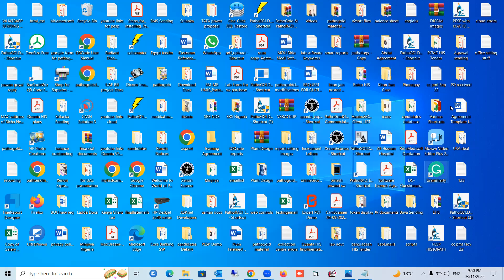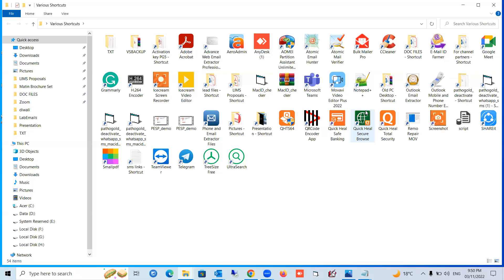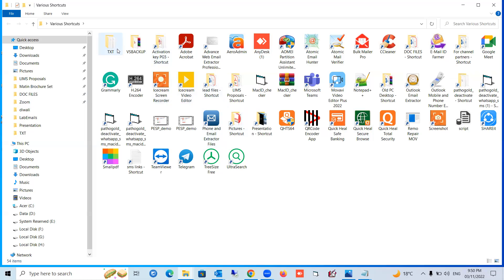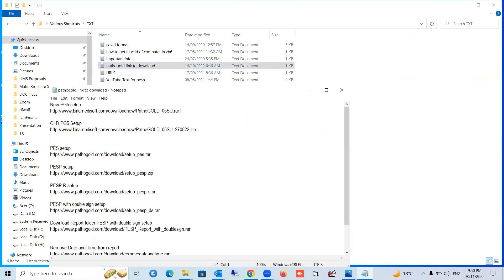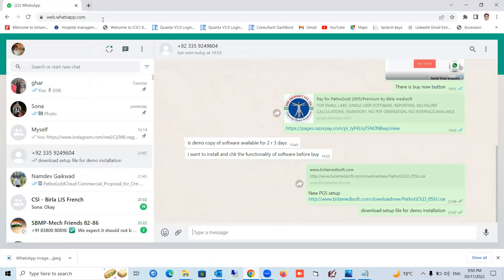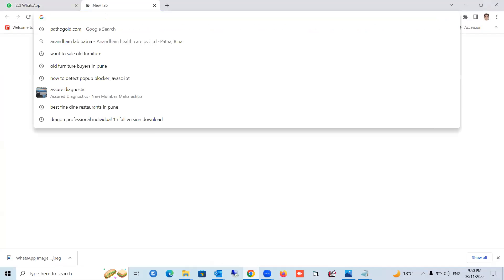Let's see the process completely. You go to the URL — the URL is given in your description. You go and download from that URL. This is the URL which you will download from. You click on this URL, put it in the browser, and download it.